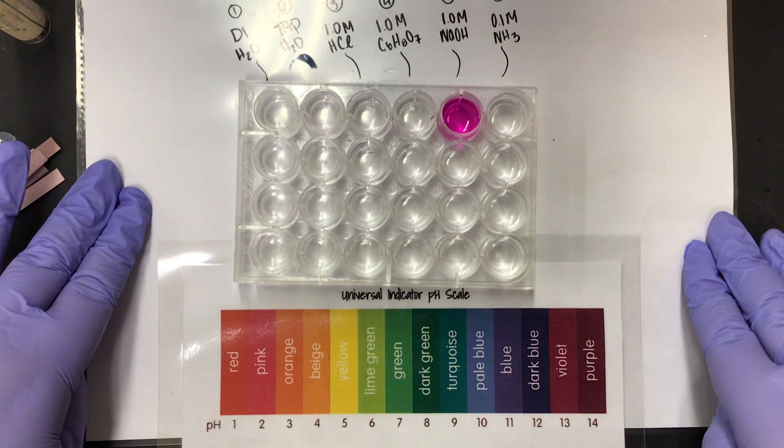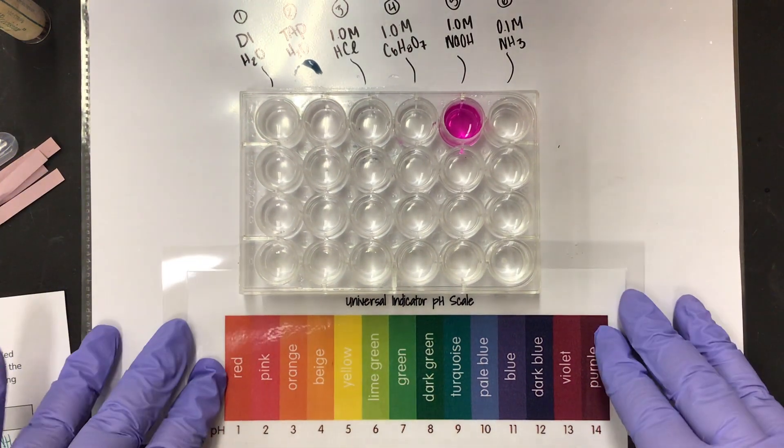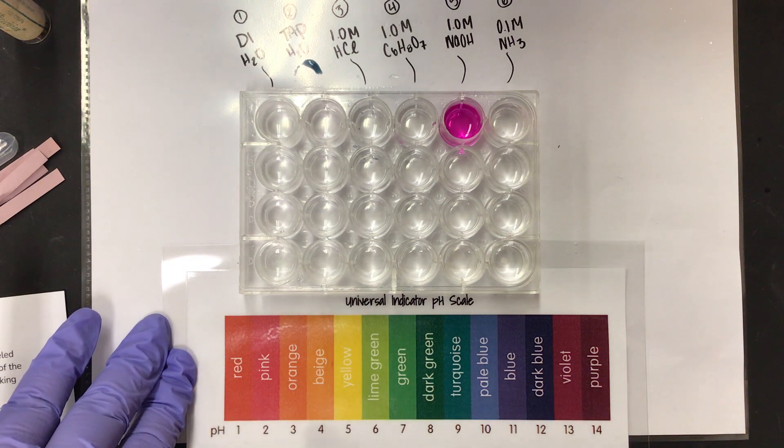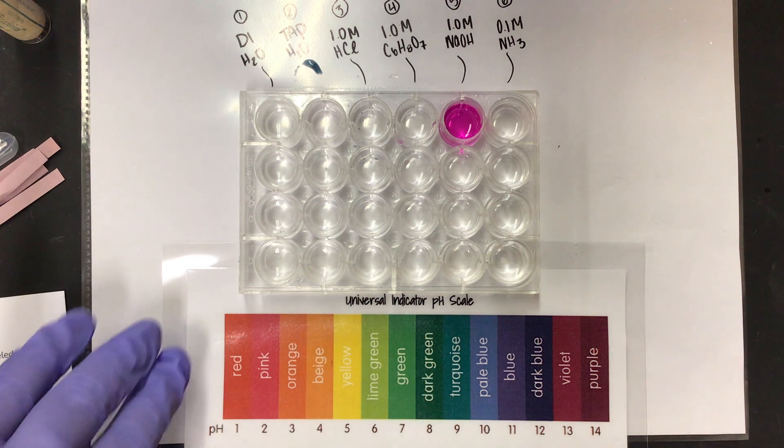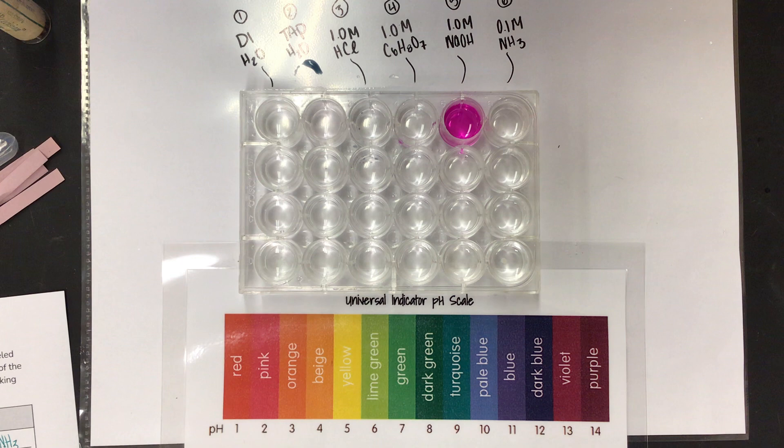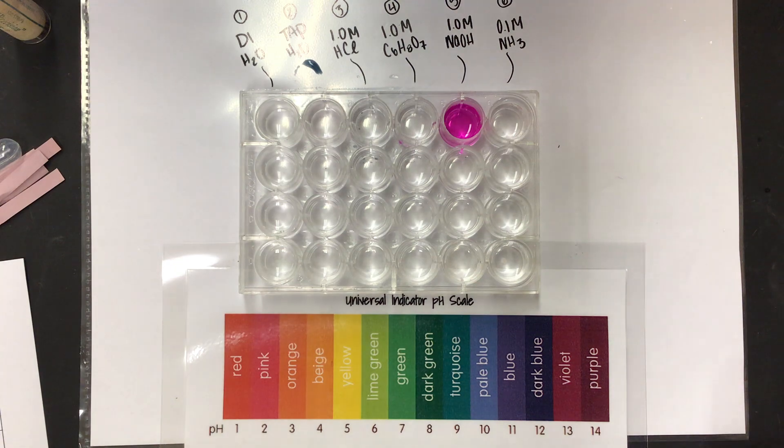Here are the colors that universal indicator could turn and underneath it is the corresponding pH values. I'm going to put a couple drops in each of these wells, identify the color, record that in your data table, and then indicate the approximate pH based on the color.